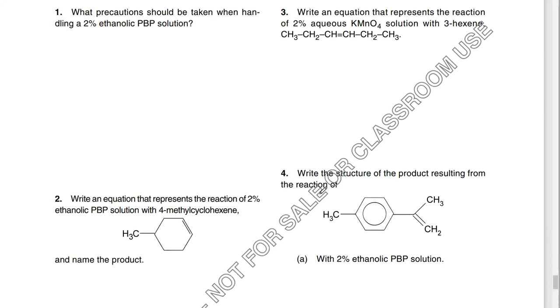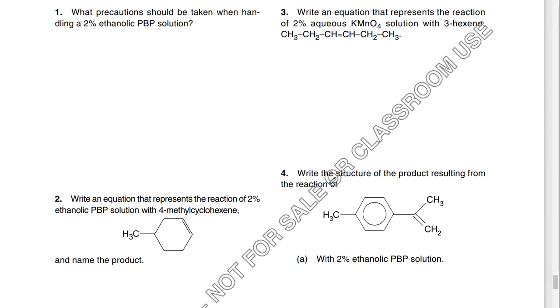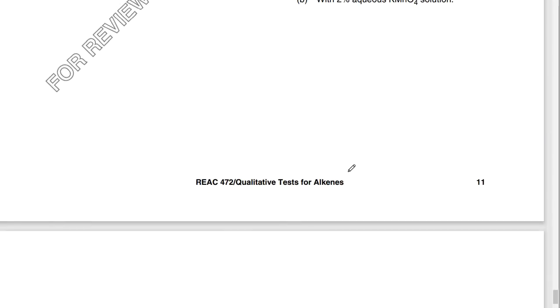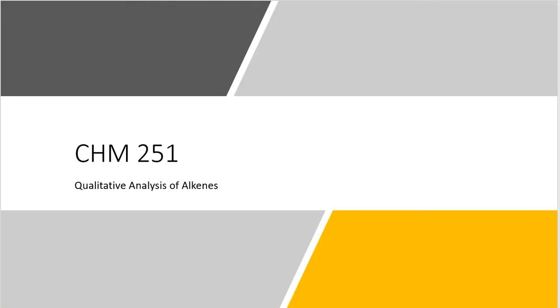Finally, here at the very last page of the lab document, you're going to see some pre-lab questions. Once more, I do want you to do the pre-lab questions as well. So answer these pre-lab questions. You'll be able to find these answers either in the lab video that you just watched or in the background information as well. That would be a very good place to start to round up those answers.